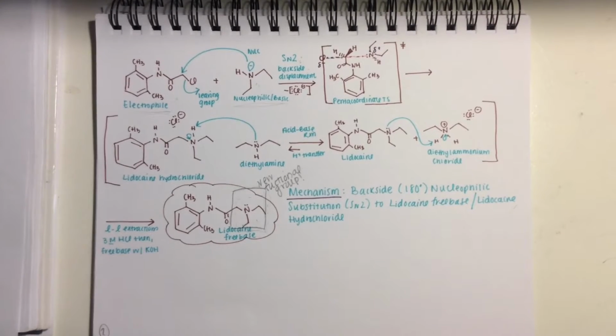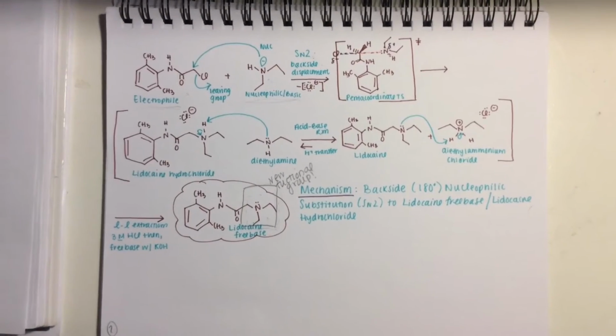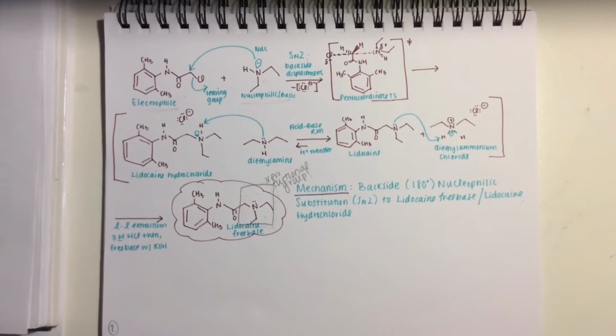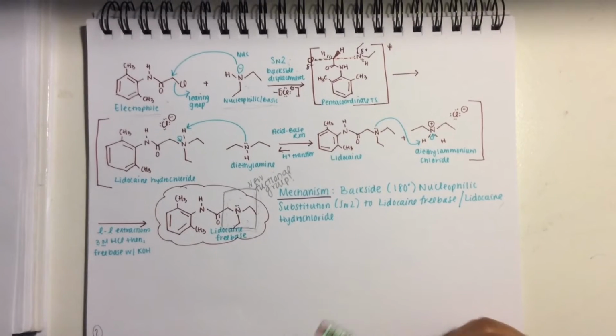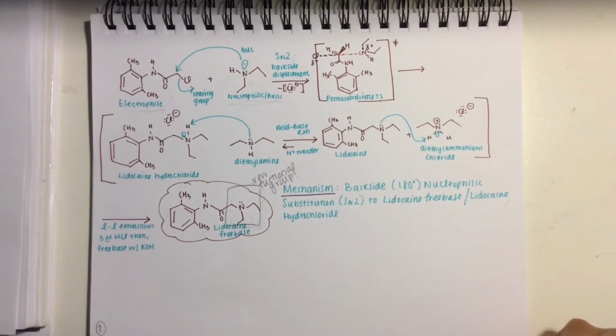The diethylamine is not the strongest nucleophile, and the toluene is not a polar aprotic solvent that will stabilize the transition state. But regardless, the reaction is going to happen with a lot of heating. The diethylammonium chloride is the byproduct of the SN2 reaction.